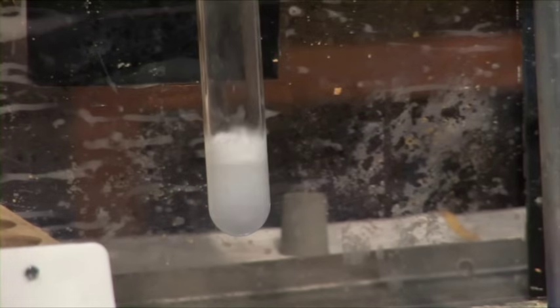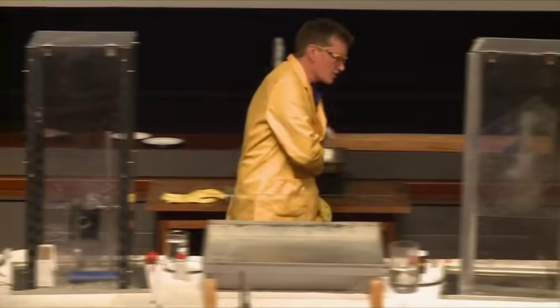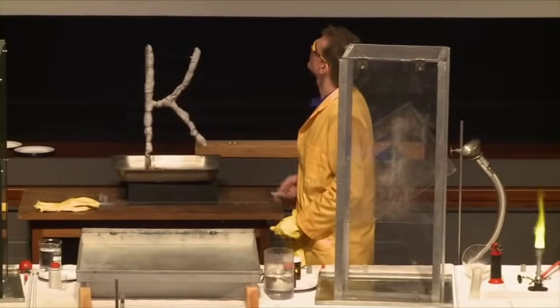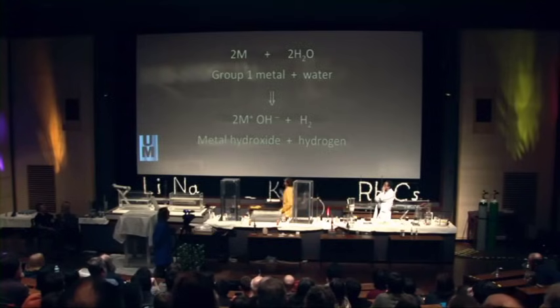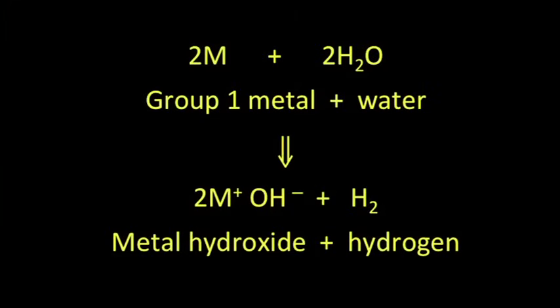So this is lithium. You can see that it's bubbling rather nicely — it's forming hydrogen gas. And in fact, we can see the chemical equation: it's the same chemical equation for all of the elements. We have the metal reacting with water to form the metal hydroxide and releasing hydrogen gas.